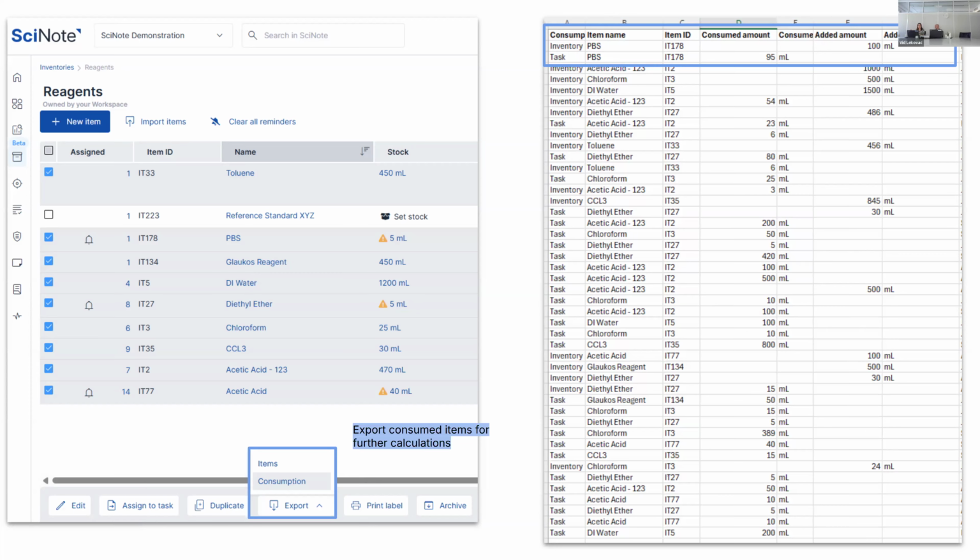So was it an output from an experiment? What item did it come from? What the parent is. Again, seamlessly done on the ELN part, connected with the inventories, but most importantly, and this goes back to the compliance question as well, you can always trace back and see what was done, when it was done, who did it, what was the parent, so what was actually happening.